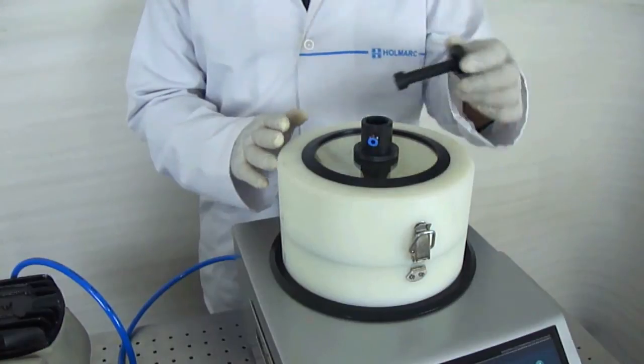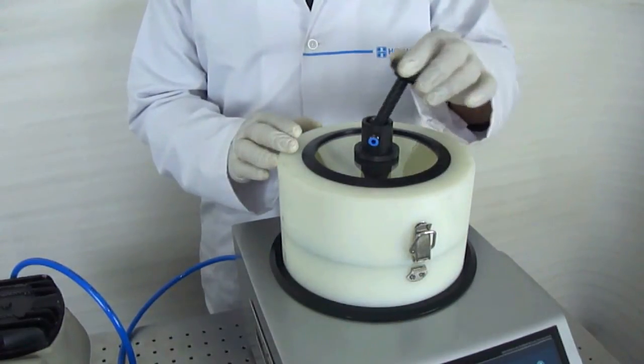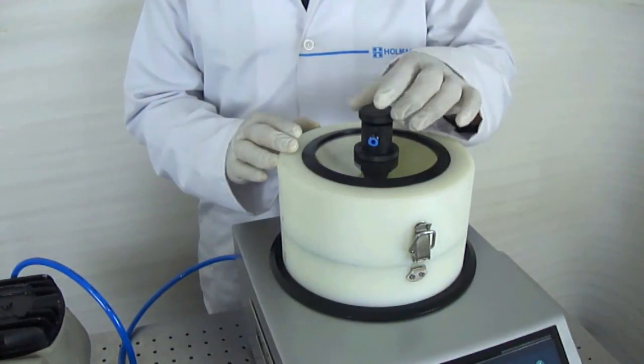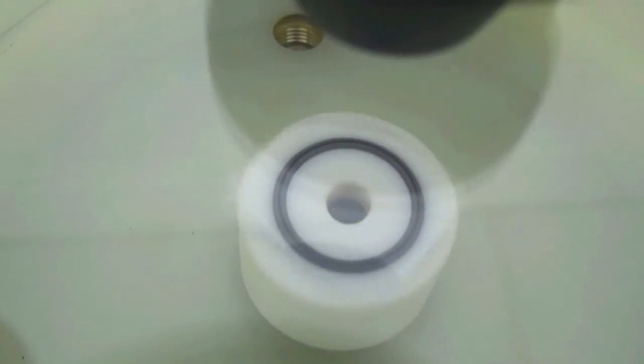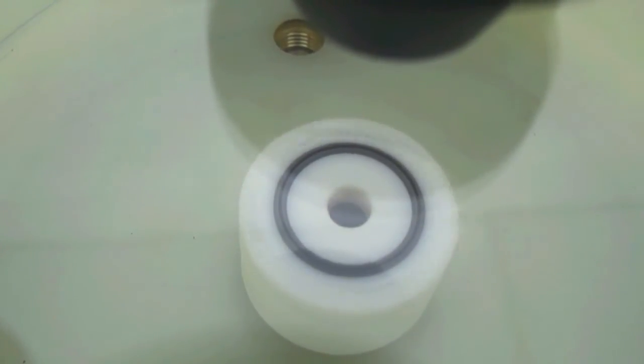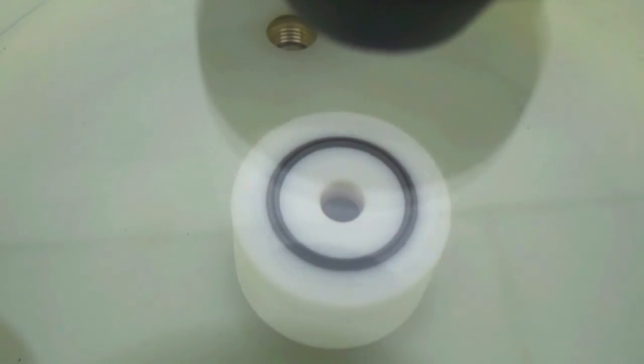A solution inlet is provided to inject the coating solution into the chamber. A transparent cover protects the surroundings by keeping the spin-off solution inside the chamber.